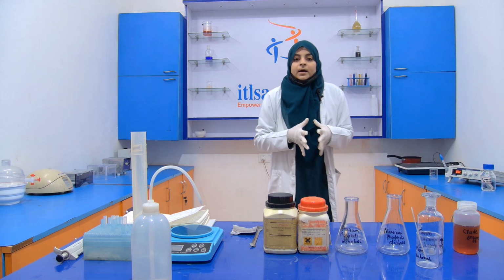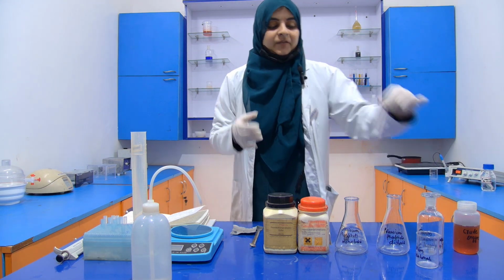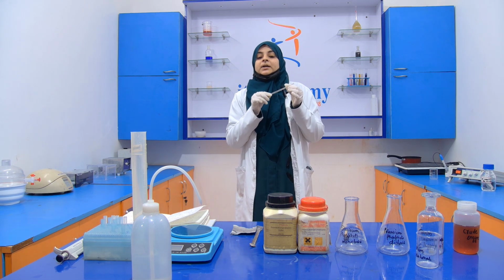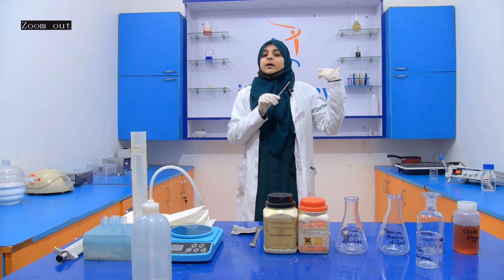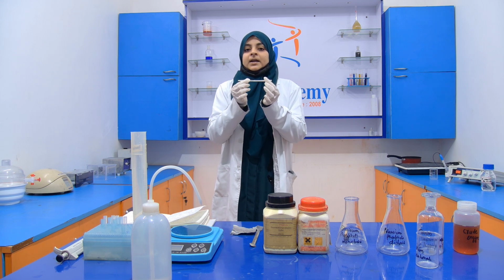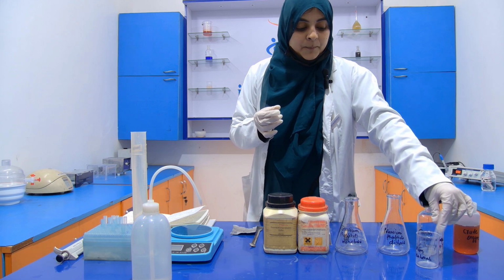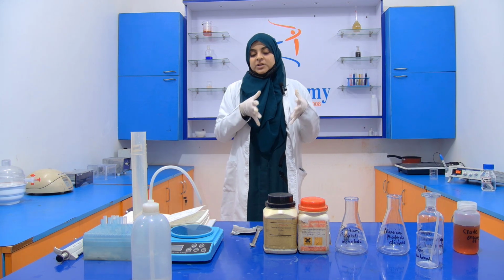Now our dialysis membrane is activated. See, after 30 minutes: 10 minutes in boiling distilled water, 10 minutes in 2% sodium bicarbonate, and again 10 minutes in boiling distilled water. After that, see, it is activated. Now we have to prepare a 50 millimolar potassium phosphate buffer.